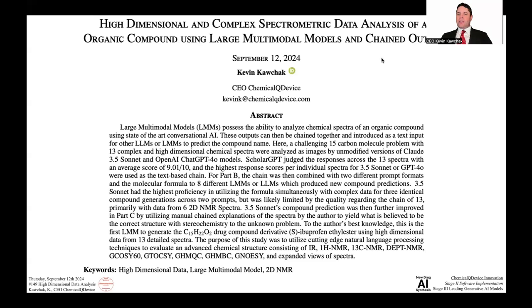High dimensional data and complex data is known to be a difficult task if you're just doing things manually. But with AI models, they can either reduce dimensions or go about the problem a different way, mostly automatic at this stage. So basically what I'm going to pick up with here is part C. So part C is basically this.